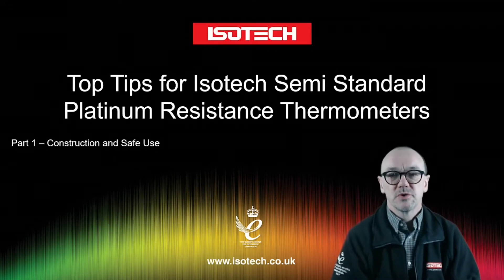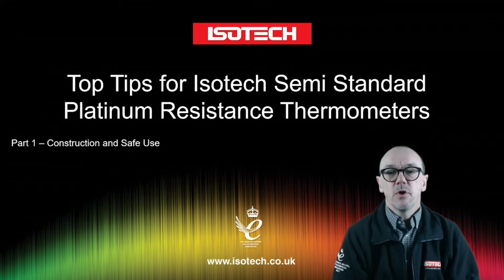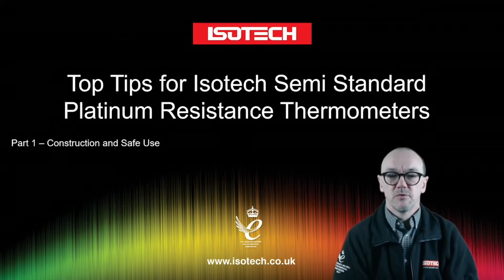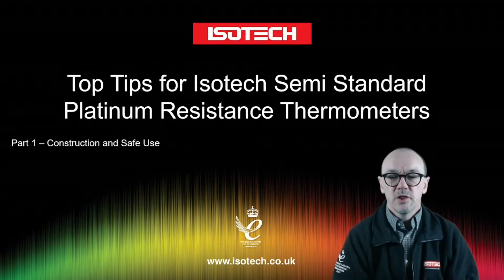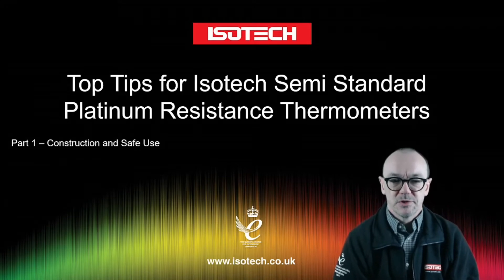Hello and welcome to another introductory video to temperature metrology. Here we're looking at top tips for handling ISOTEC semi-standard platinum resistance thermometers. In the first part we'll look at what a platinum resistance thermometer is and what our semi-standard thermometers are.